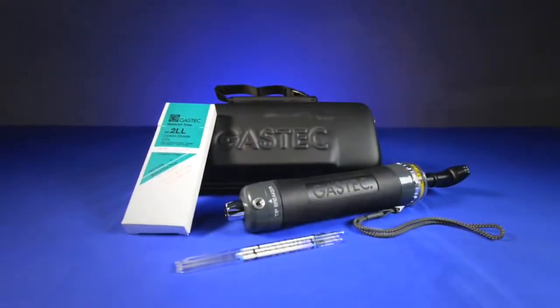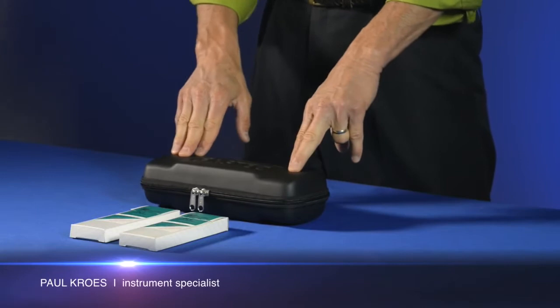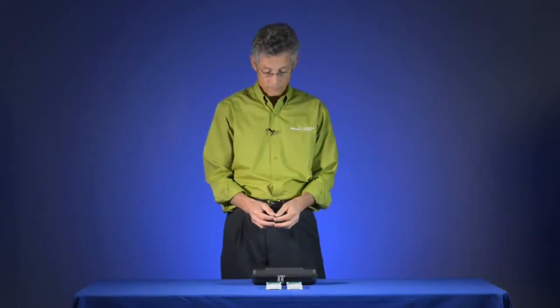This is a demonstration on how to use the GAS-TEC detector tube system. My name is Paul Crowes and I'm with Levitt Safety. GAS-TEC detector tubes are available for over 500 different gases. Many of these gases are hard to measure with other instruments, so the detector tube is a very useful tool in most environmental and industrial environments.